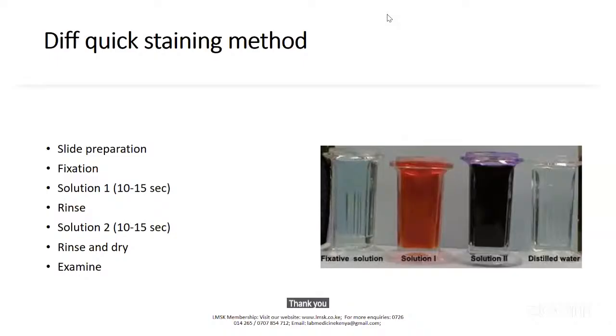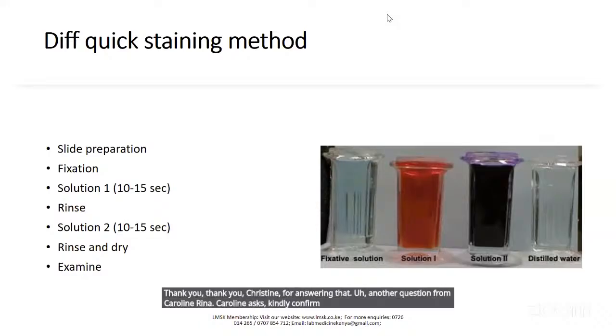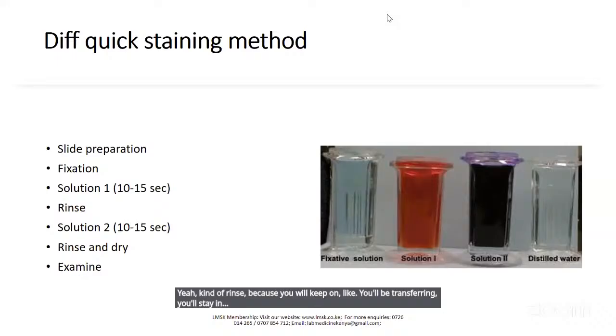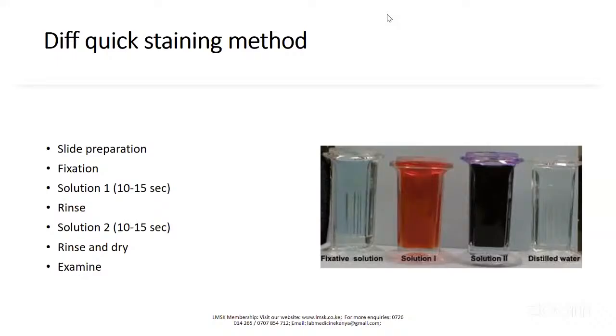Thank you, Christine, for answering that. Another question from Caroline Rinya. Caroline asks, kindly confirm if we do rinse after field stain B before going to field stain A. Yeah, kindly rinse, because you will be transferring solution 1 to solution 2. So you rinse.